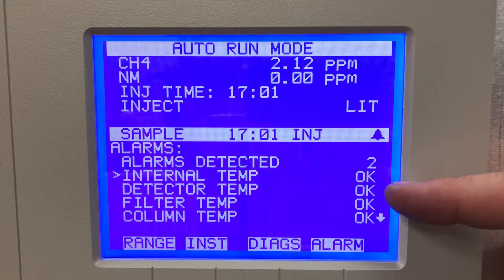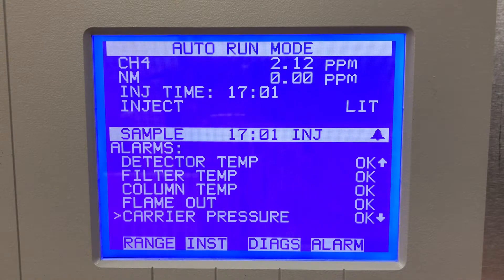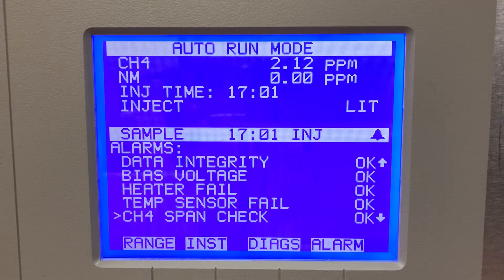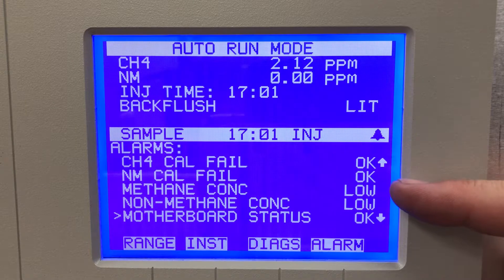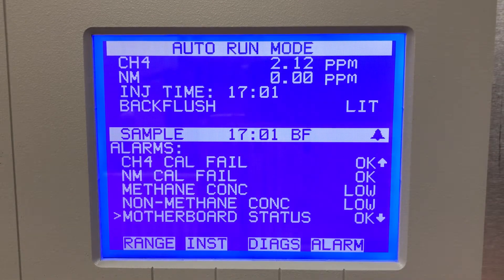The alarms menu tells me how many alarms I have and what they are. The internal detector, filter, and column are all okay. Scrolling down, carrier pressure is okay, fuels okay. If I go down and look for those two alarms it mentioned, I find them eventually — it shows low and low. It's the methane concentration and the non-methane; they're just low because I'm reading ambient low readings right now, lower than the alarms set for the unit.